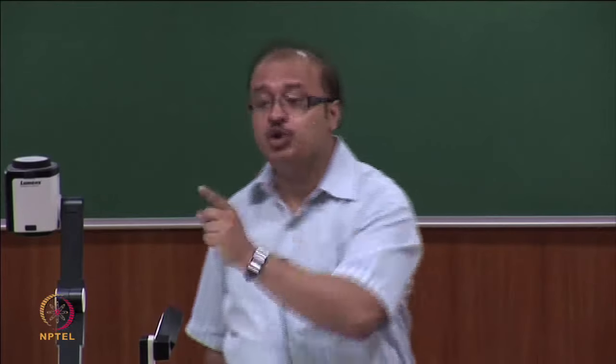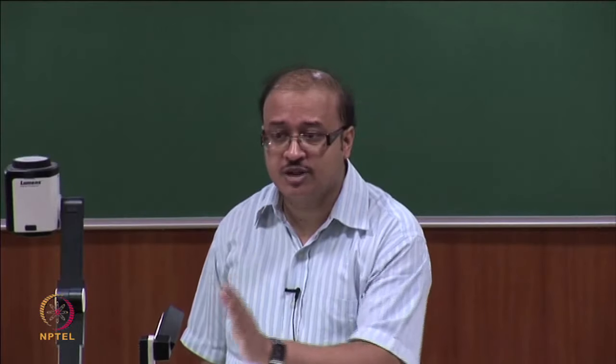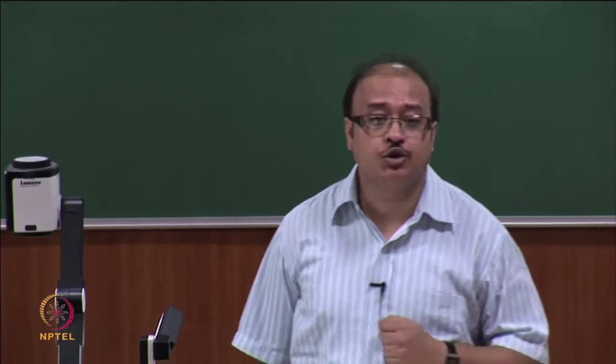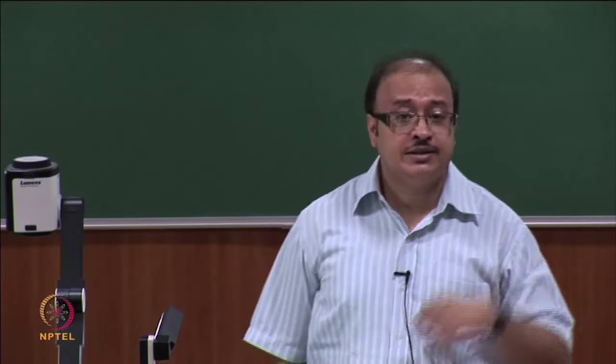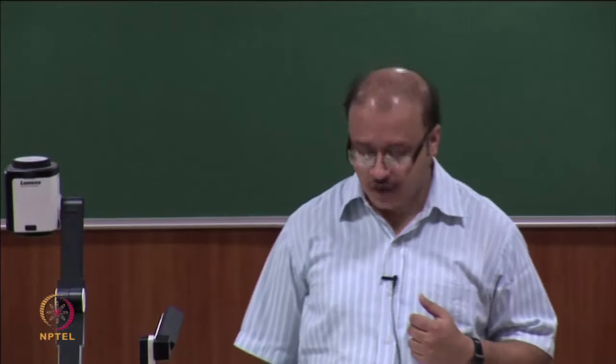However, if you do have to do measurement with aqueous solution, then you will have to resort to ATR FTIR. This is something we will take up in the next class, and that is how we will end our discussion on IR spectroscopy.